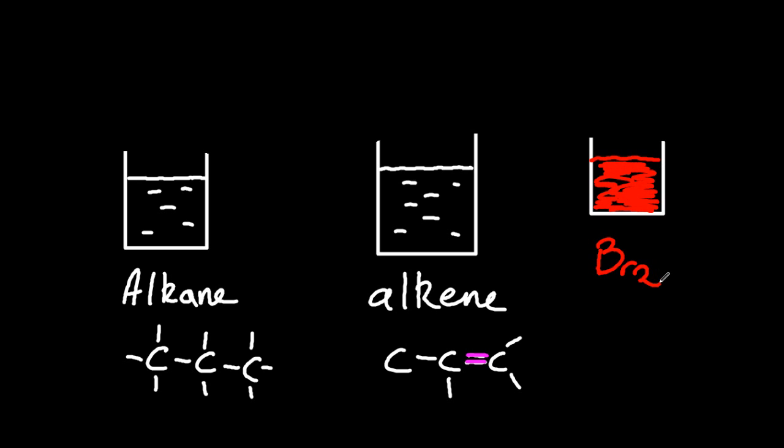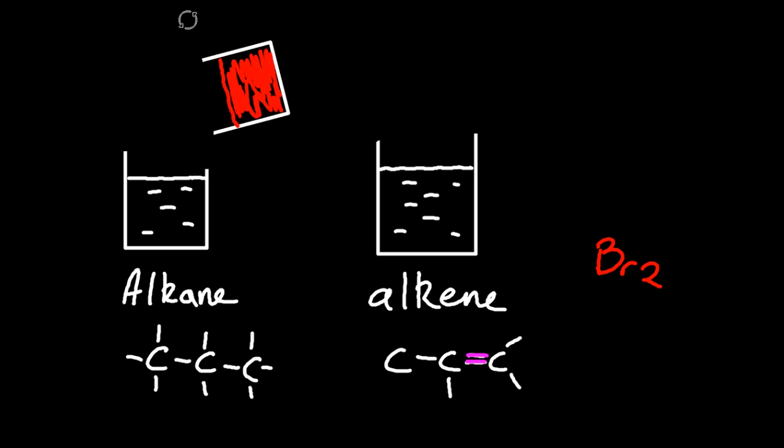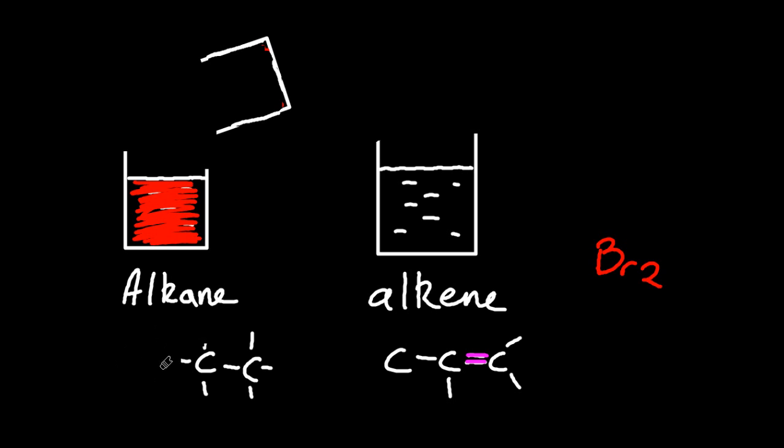Bromine water, same thing really, reddish-brown. If I pour it into the alkane, it does just what you'd think it would do, which is everything kind of ends up red. So there's no reaction there.